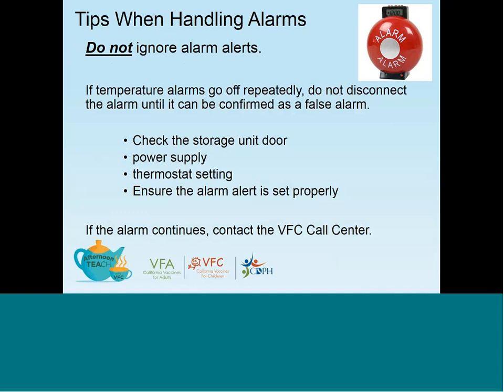Some of the things that you could do to check to see if this is a false alarm is check the storage unit door, take another look at your power supply, check the thermostat settings on your storage unit. And then another helpful tip, make sure you have the alarm limits set properly. If the alarms continue, contact the VFC call center for assistance.